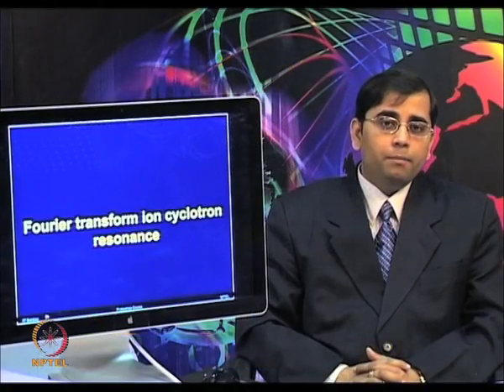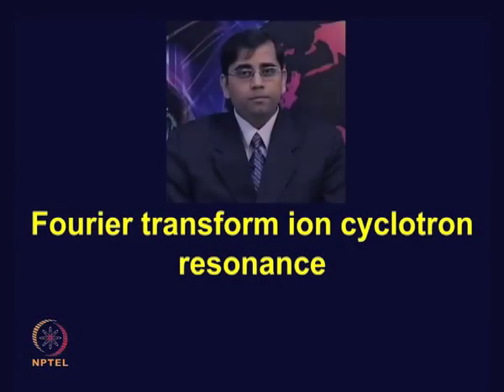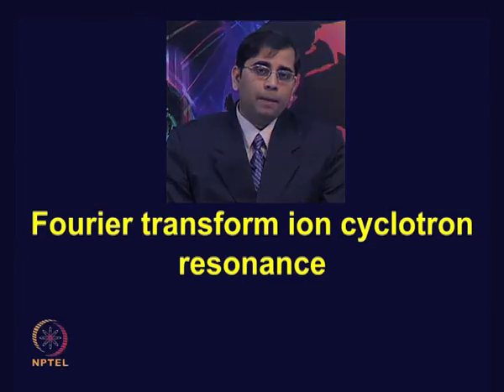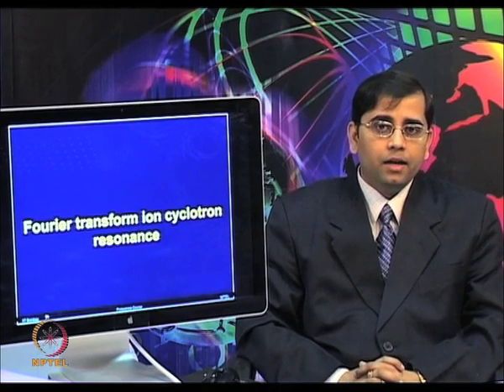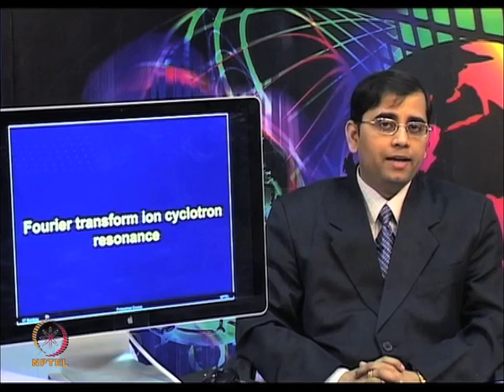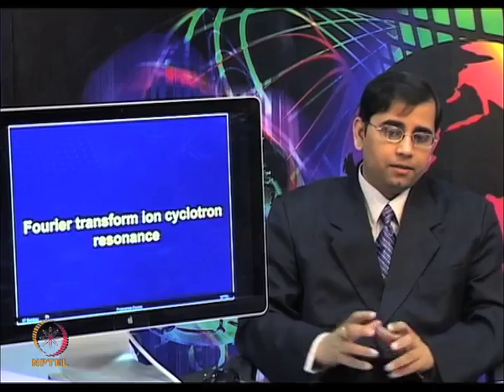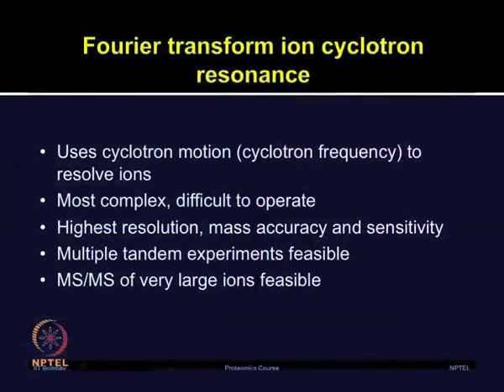One important mass analyzer is Fourier transform ion cyclotron resonance, or FTICR. Due to its high resolution and MS capabilities, the application of FTICR MS in combination with electrospray ionization has been employed for large biomolecules, and now it is also used in proteomics. An FTICR MS can be considered as an ion trap system, where ions are trapped in the magnetic field.